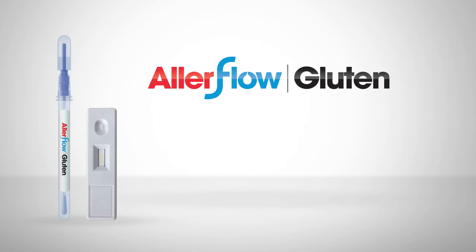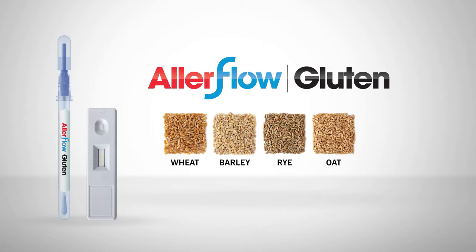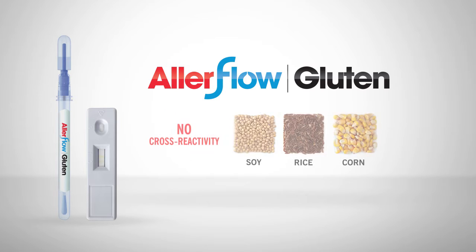Allerflow Gluten is a rapid and convenient test for the detection of gluten residue on food processing surfaces. Allerflow Gluten is specific to the toxic fraction of gluten from wheat, barley, rye, and oat, with no cross-reactivity with soy, rice, or corn.